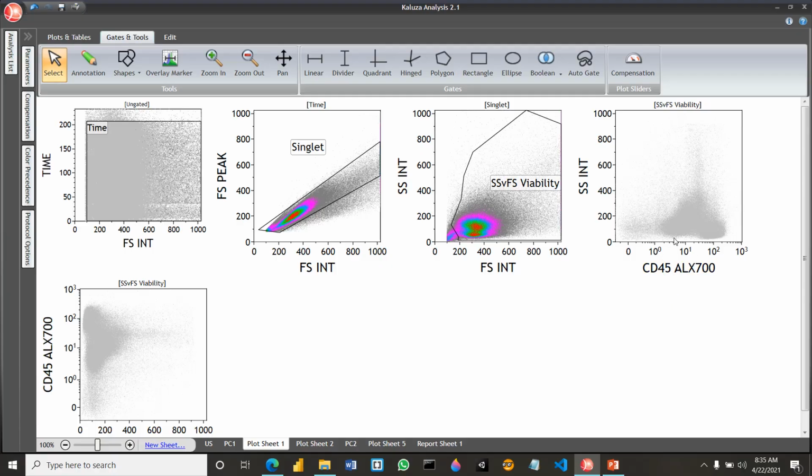Now this plot just gives us the idea of what the processing was, how many granulocytes there are, and whether due to processing we lost some granulocytes. It looks like during processing we have lost some side scatter, possibly this was a transported sample. Anyway, I've taken this random sample so that we know we can deal with the issues which can be faced in any random sample.